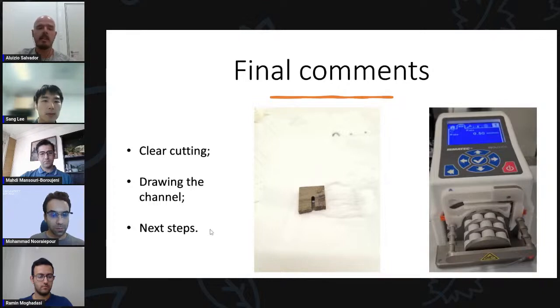And now the next steps, besides validating the microfluidic device in the beamlines, are to improve the device by considering temperature, to control the temperature in the reaction, as well as pressure, and try to reproduce the conditions as close as possible to what we have in nature.